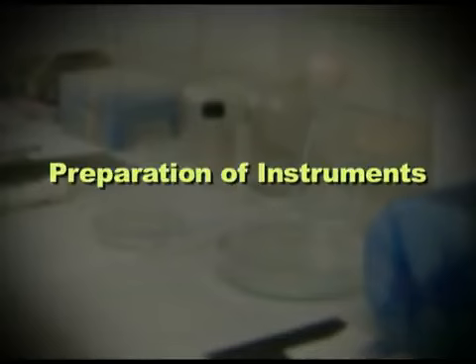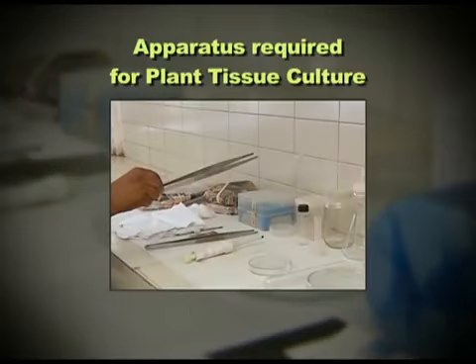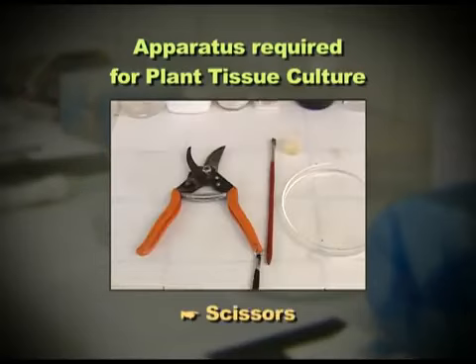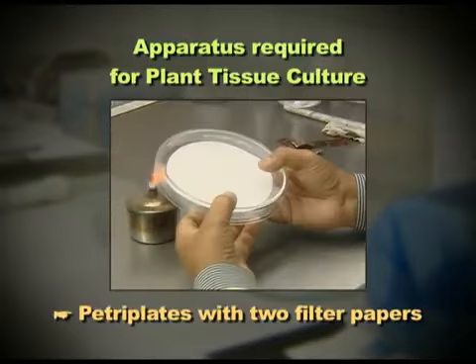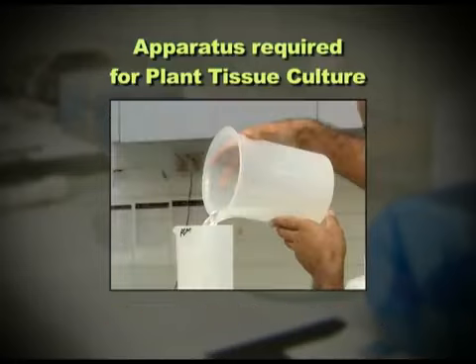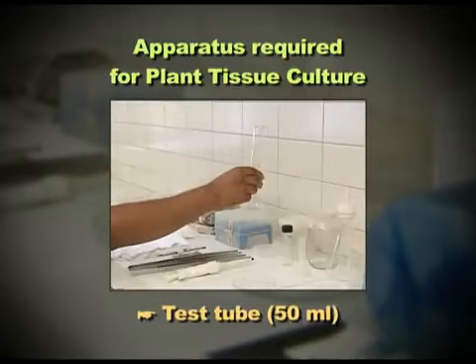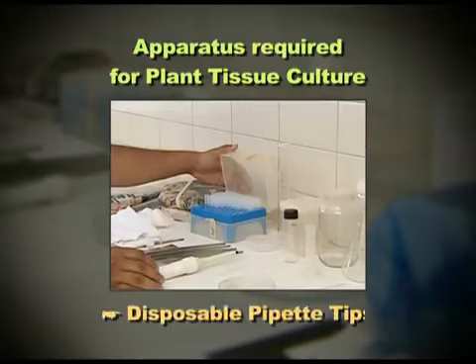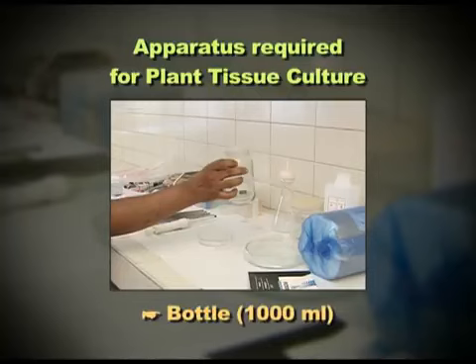Preparation of instruments. Apparatus required for plant tissue culture are forceps, scissors, blade holders, disposable but sterile surgical blades or sharp scalpel, Petri plates with 2 filter papers, a 500 milliliter beaker, 3 250 milliliter Erlenmeyer flasks, a 50 milliliter test tube, a box containing disposable pipette tips, pipettes, and a 1000 milliliter bottle with screw cap.